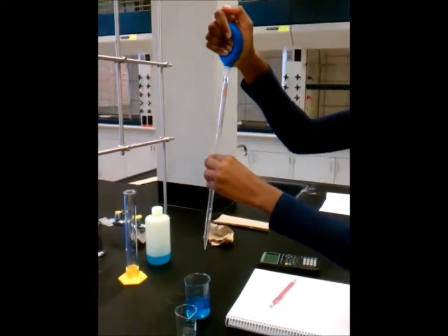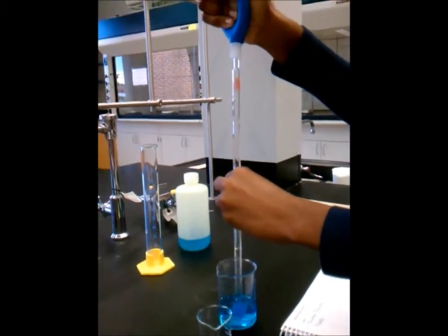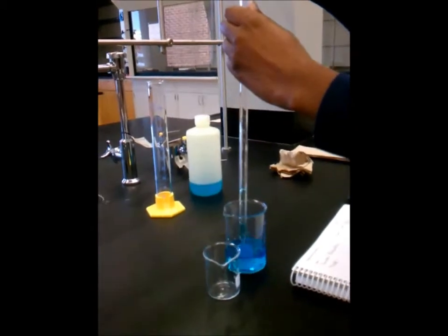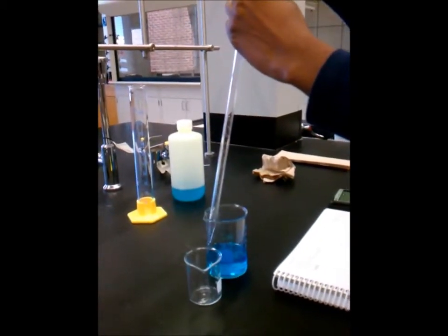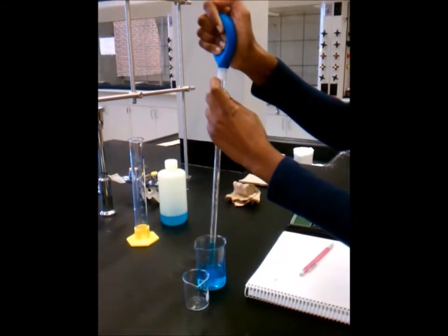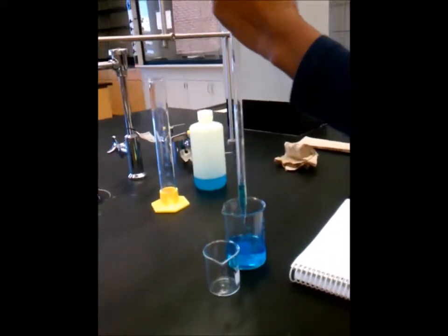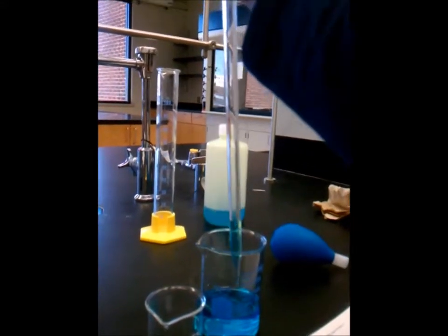You would put the pipette in your solution, careful not to touch the bottom, and gather some of the solution. I got bubbles, so I'm going to release on the side and repeat, drawing the solution. Remove the bulb and apply my index finger, and that is a more secure hold.